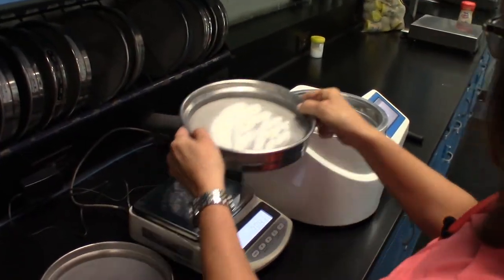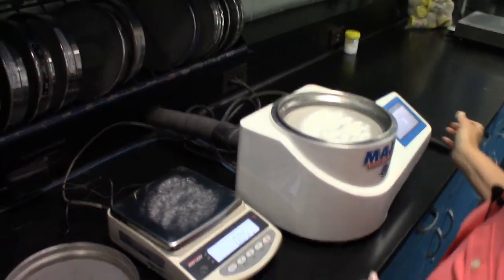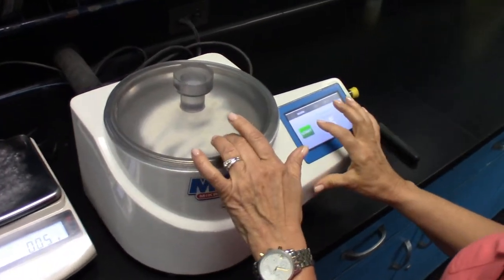Once I have that weight recorded, I will place the screen on the micro air jet sieve, place the cover on the sieve screen, and press start.